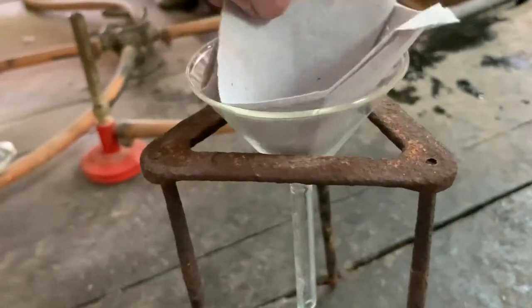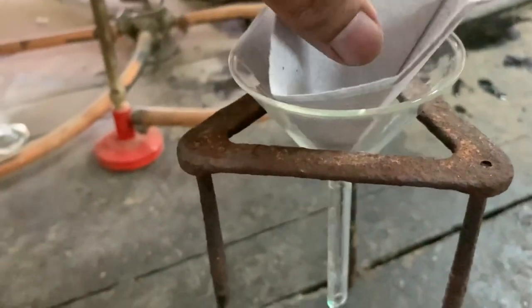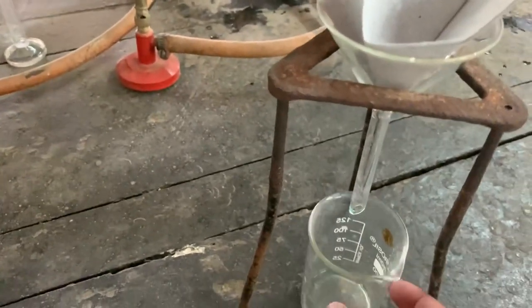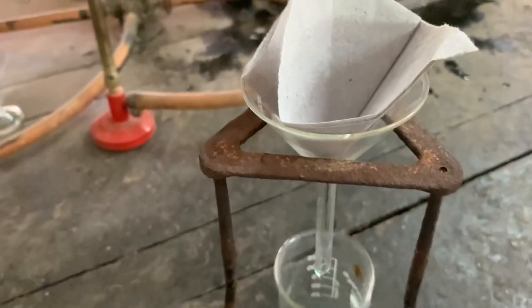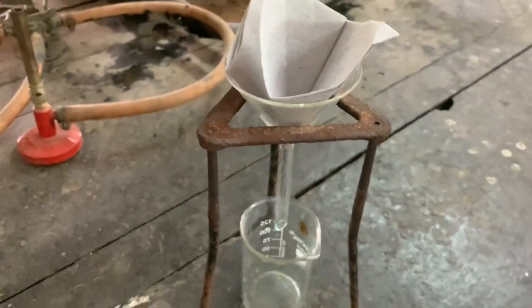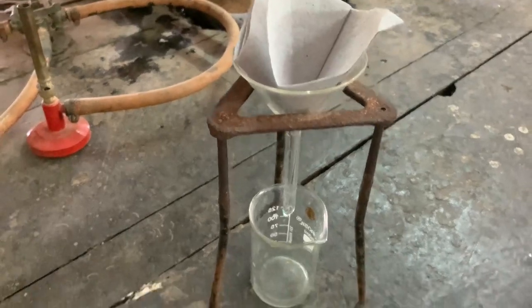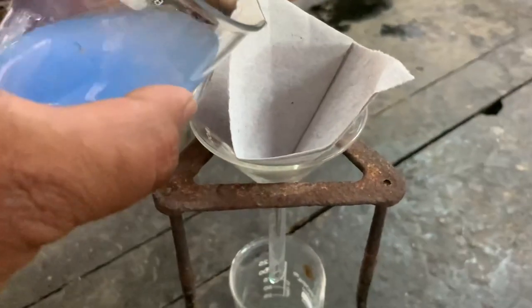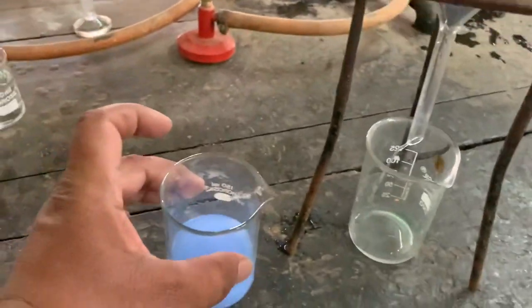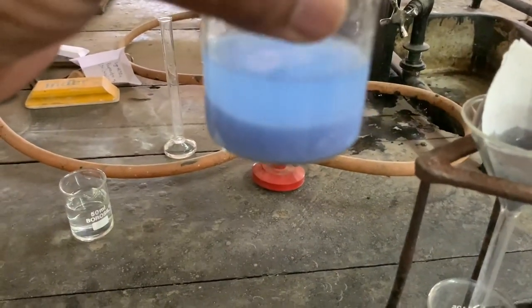Okay, we'll filter our complex through this. It is about almost 15 minutes. So after 15 minutes we are filtering our complex. Okay, so let us start filtering our complex. So carefully pour the supernatant liquid. You can see the complex has settled down.